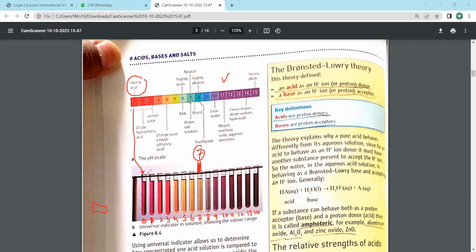Now, if you get a color like this, it means strong acid, because it is pH 0. Understand? And come towards the last here, the 14, not toward this one, till here, that indicates your solution is highly acidic or alkaline, that is extreme. Now, I will explain both the ranges, from most extreme acid to the most extreme alkaline or base.